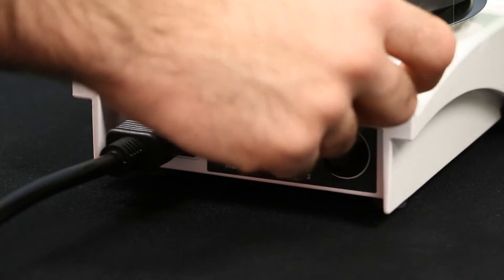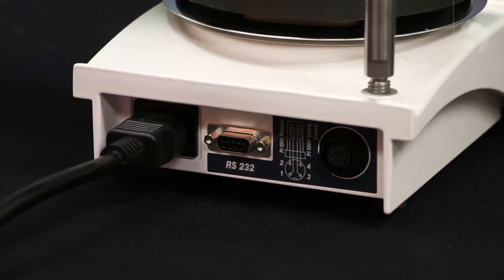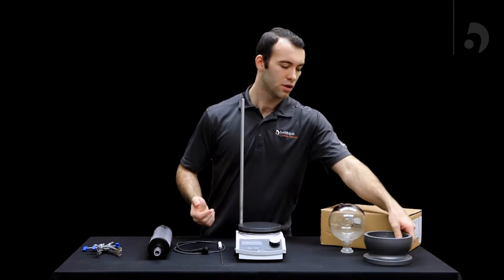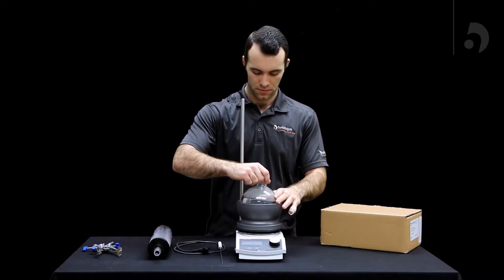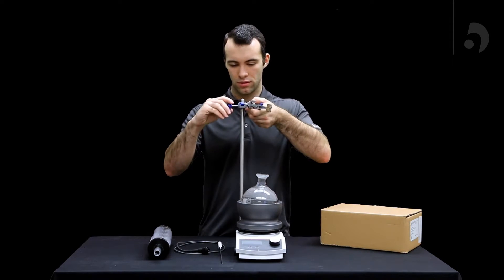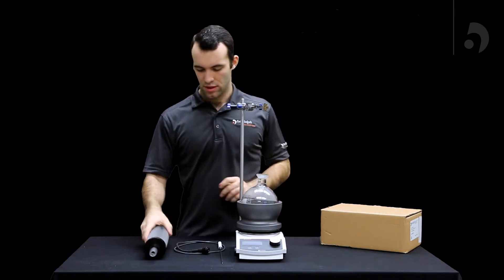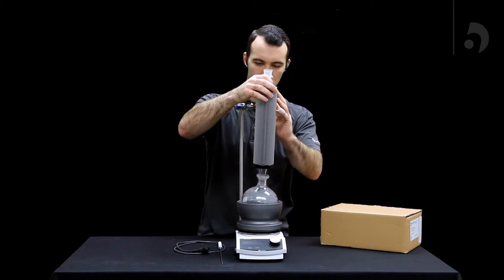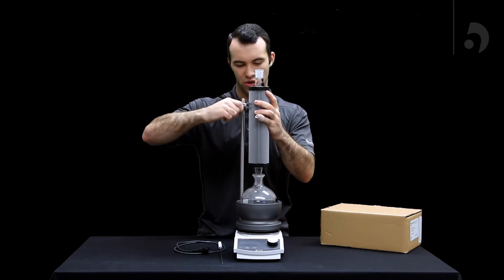After that, you're going to pull off the black plug that's in the back and insert your support rod. After you insert your support rod, you can add your heat-on block and your flask. You can add your clamp — make sure to screw it on very tight — and then insert your Fendenser, also making sure that is on tight.